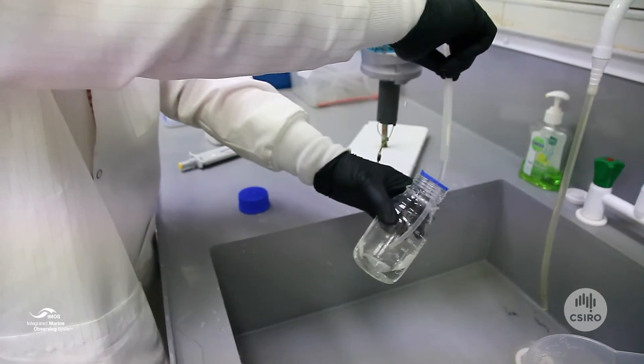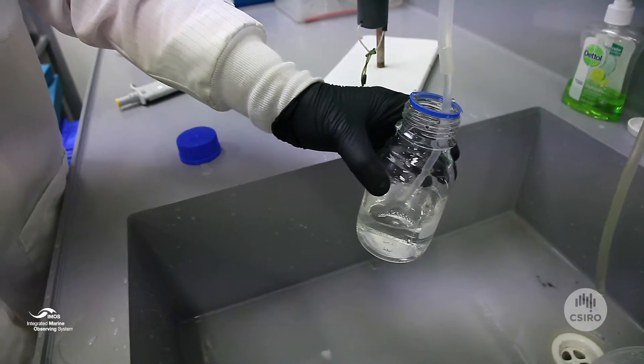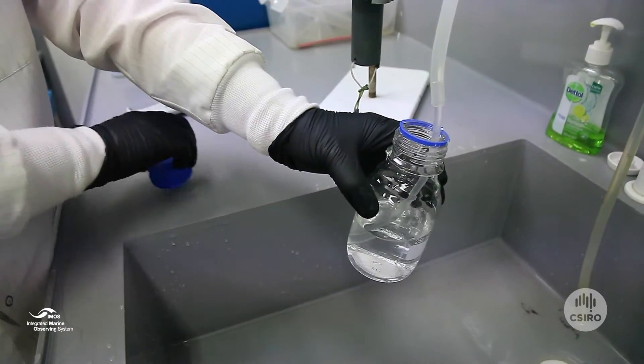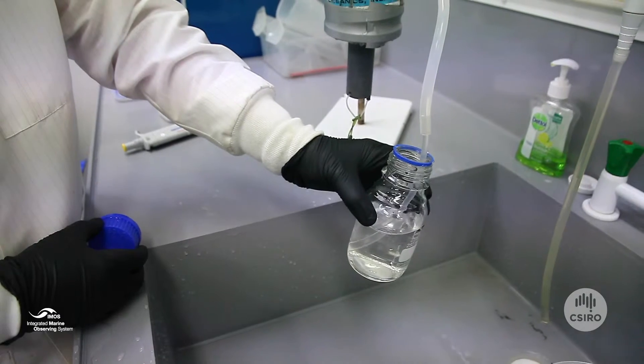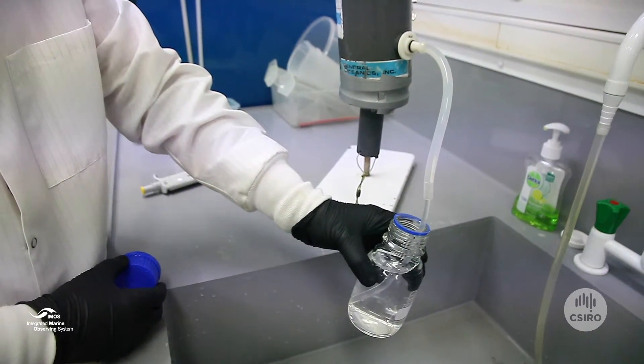Then gradually release the tube to start the flow again without adding bubbles. Allow the bottle to fill and then overflow, and rinse the lid three times.